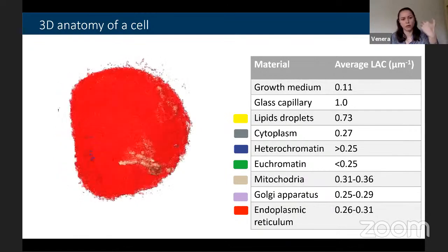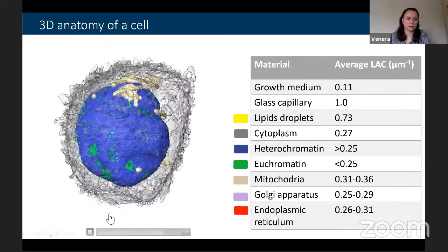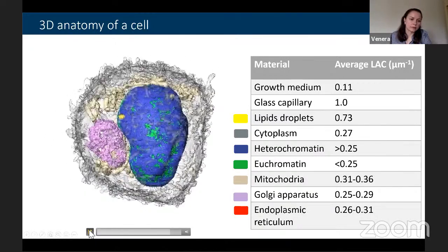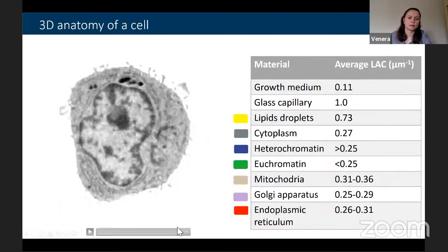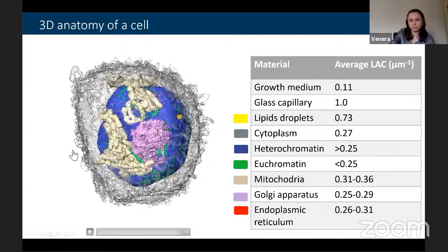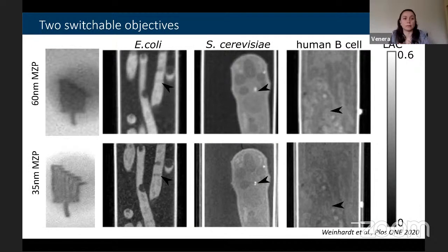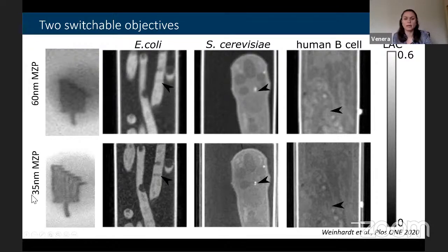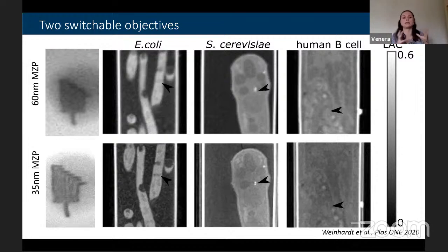Not every cell has the same organelle content — for example, this particular cell has a lot of endoplasmic reticulum. In 3D one can see the Golgi apparatus, lipid droplets, mitochondria, heterochromatin, and euchromatin. Last year the microscope was upgraded to two switchable objectives: the previous 60-nanometer resolution is now complemented by a 35-nanometer objective, placed side by side so one can swap between them — acquiring a large field of view first at 60 nanometers and then zooming into regions of interest at 35 nanometers.